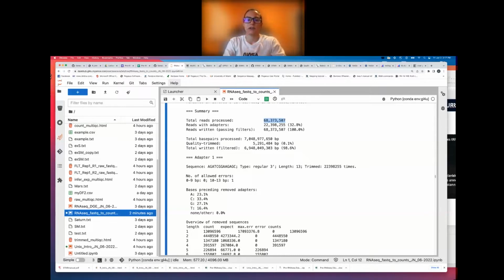How does one undo gzip? Good question. You could use a tool called gunzip. Unzip is if a file is just zipped. If you have a file that ends in .zip, you would uncompress that on the command line with unzip, I think. Someone correct me if I'm wrong. If you have a gzipped file, you use gunzip to tell it that it's compressed using the gzip format and we want to uncompress it.